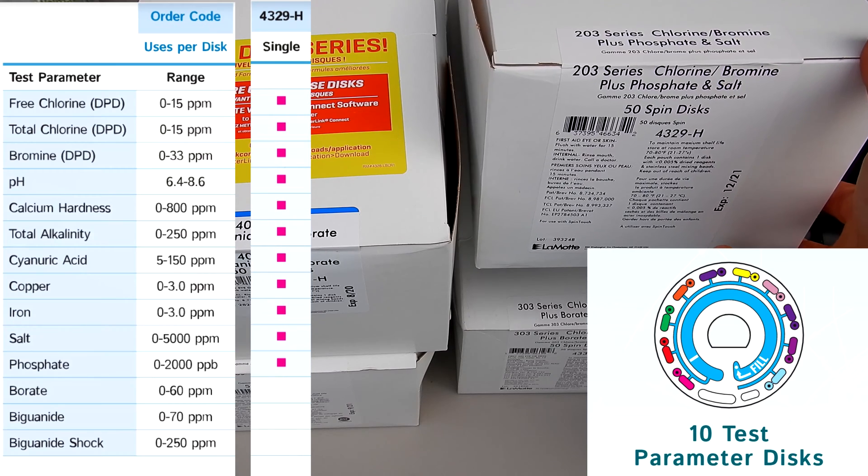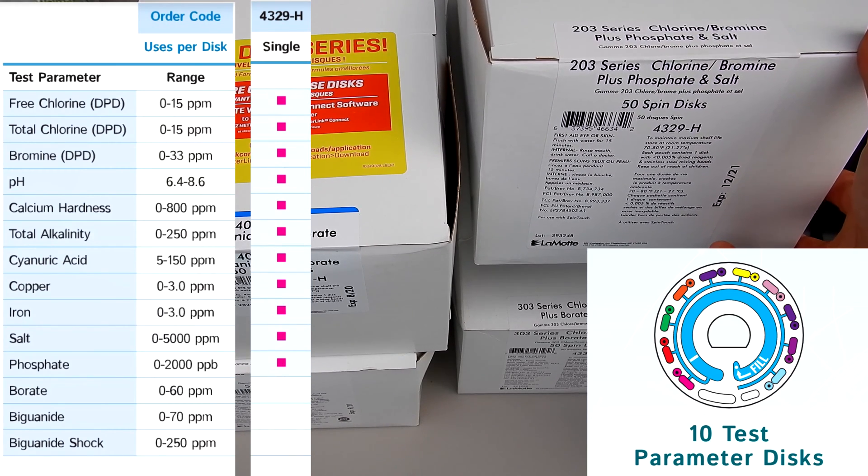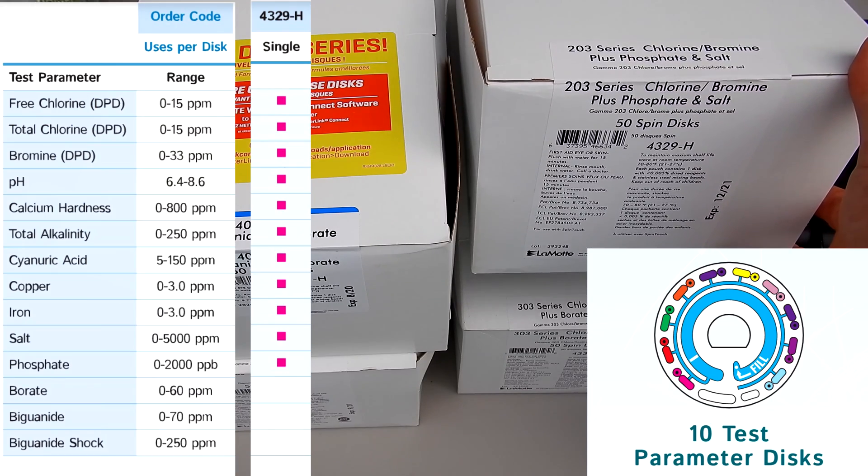The most commonly used spin disc is the 203 series. It's the 4329-H. It does all of these test factors, including phosphates and salt.